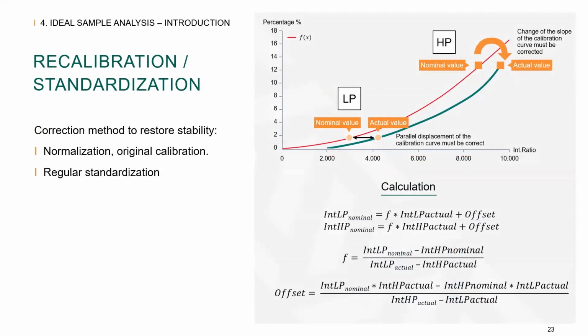In order to account for this, the spectrometers need to be recalibrated or standardized. To do so requires a 2-point restandardization to bring the spectrometer back into spec. There are two types of errors, additive and multiplicative. Using a 2-point correction method accurately corrects for both a bias created by an additive error as well as a skew created by a multiplicative error.